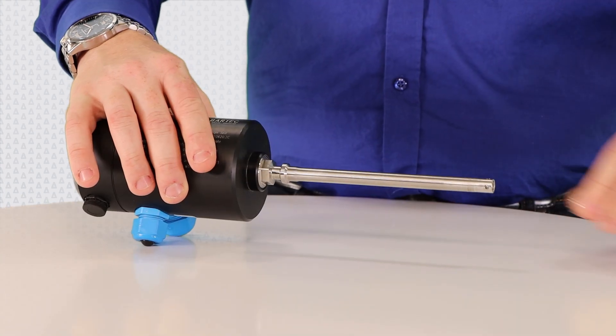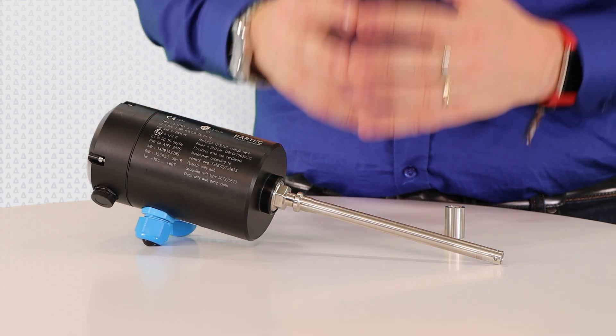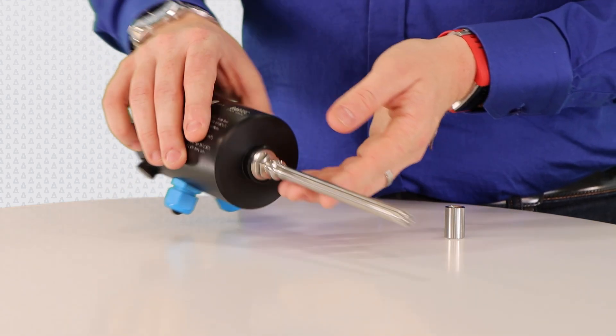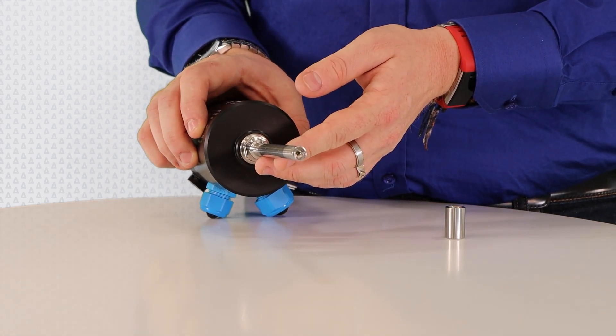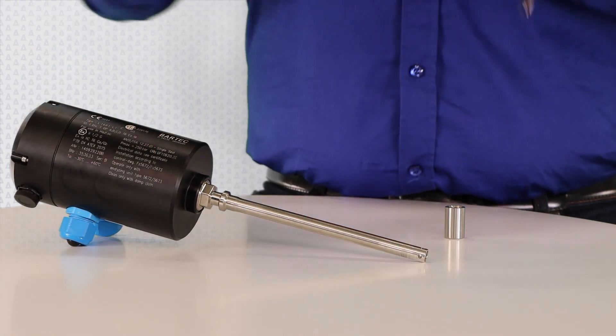And then finally, we have our probe. What is special about this probe is the tip here. I'm going to remove the protective sleeve so that I can show you the tip of the probe. As you can see, we have a glass substrate, which is a very special substrate — it has been designed and patented by Bartek, and it is special because it is porous to water.